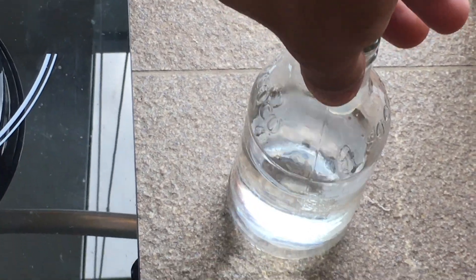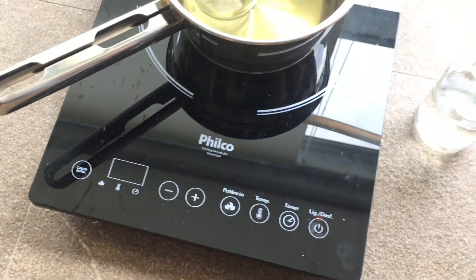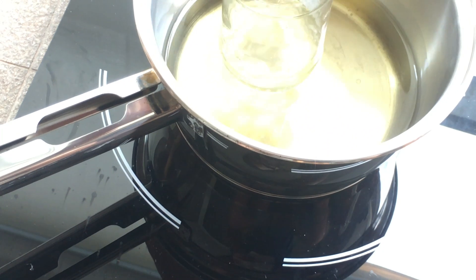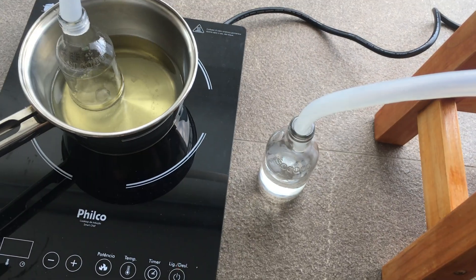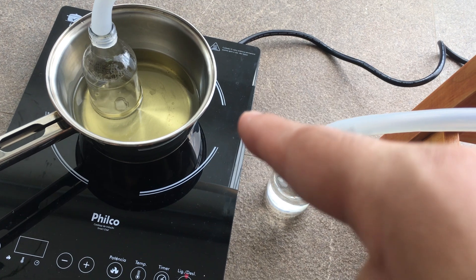If I wanted to, I could double-distill this, which I may do, and keep it at a lower starting temperature. I could also save the forerun and add it to a following distillation of any nail polish remover I do in the future, but I'm going to discard that for now.